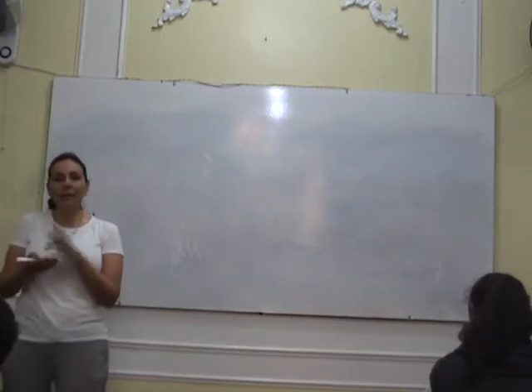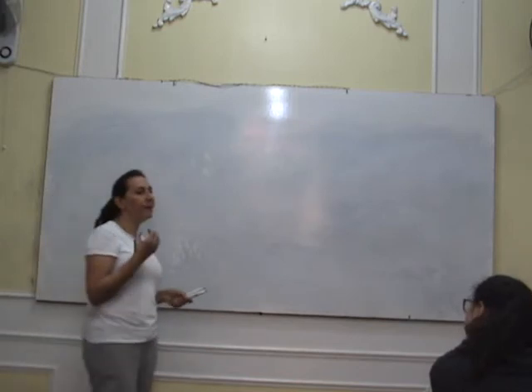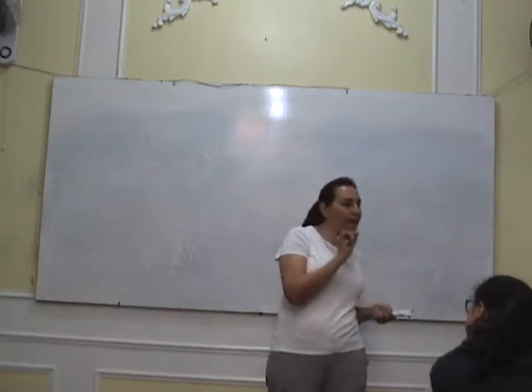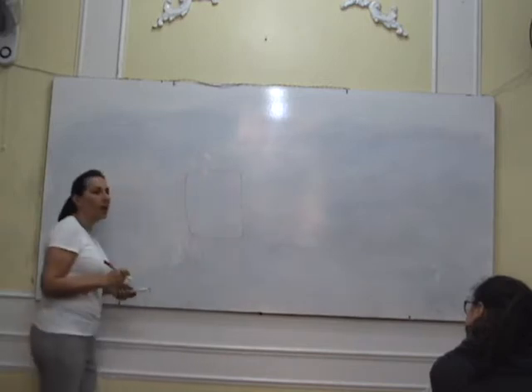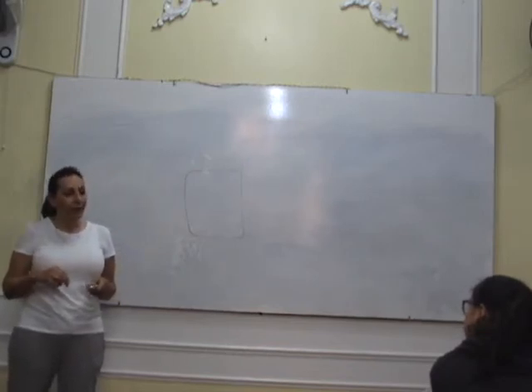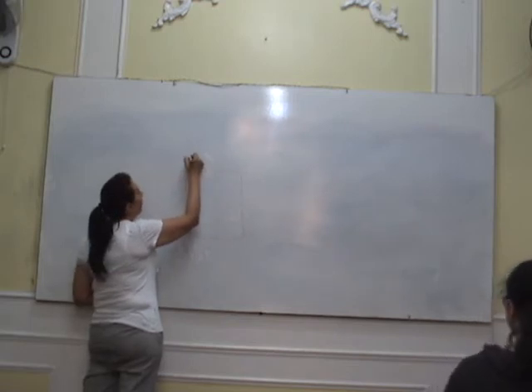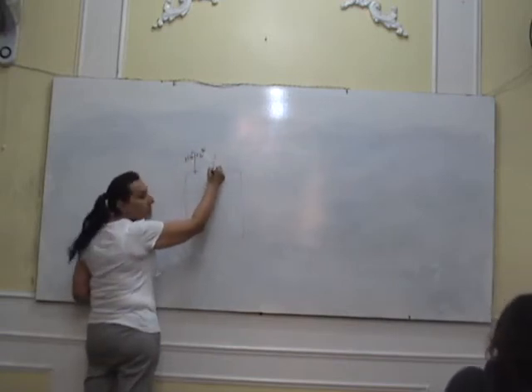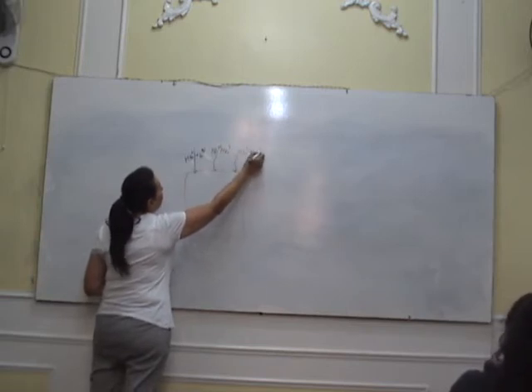And we all know that glutamic acid is charged, but valine is not charged. This means that the hemoglobin made by the mutated allele has fewer charges than the beta globin made by the normal gene. So if we run gel electrophoresis for anyone's hemoglobin, we will know what type of alleles they have. For example, I will take a normal person with HbA HbA, a heterozygous HbA HbS, and an HbS HbS.